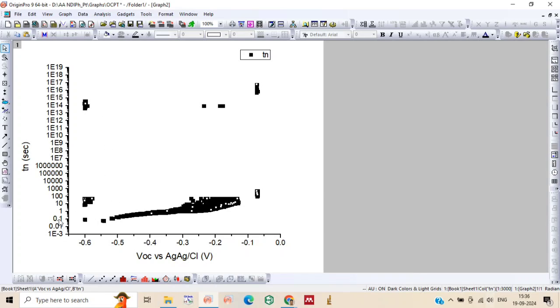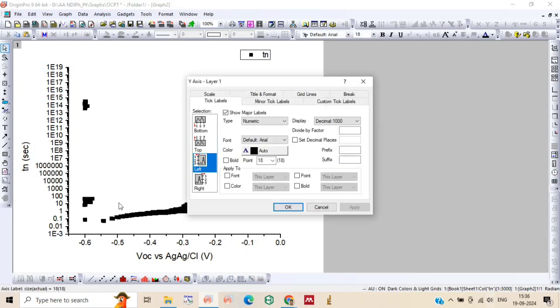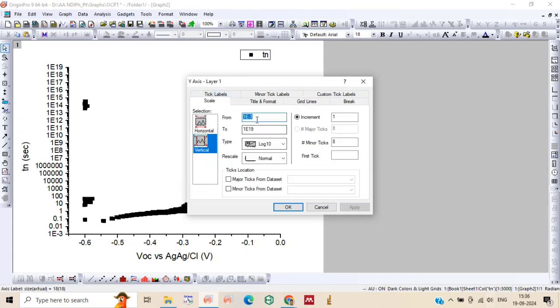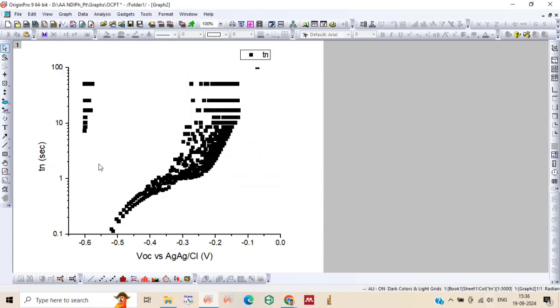Now we need to rescale the y-axis by going to scale. Starting from 0.1 to 100. And you will get the plot.